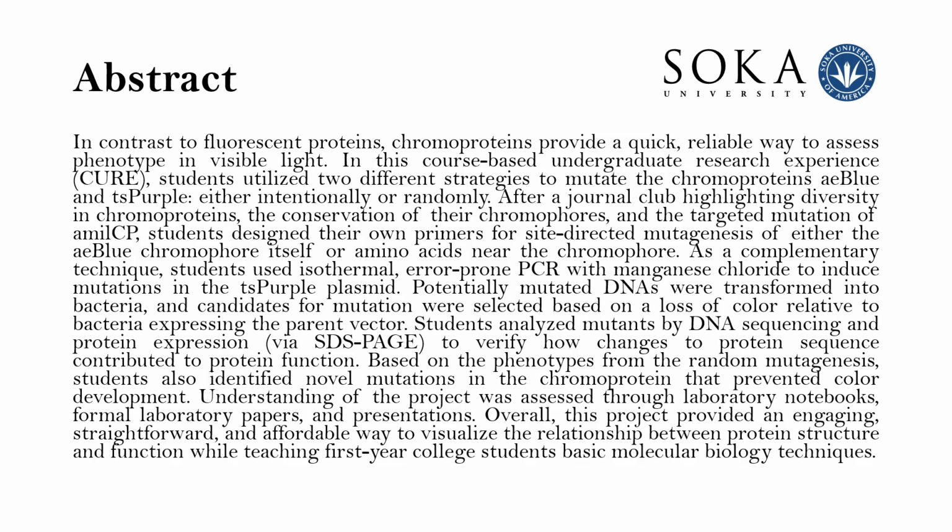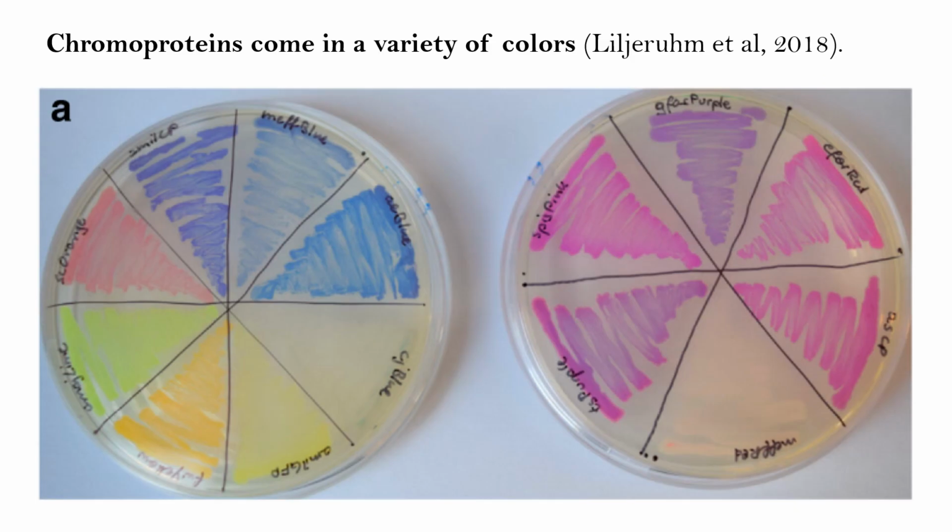Here's our abstract. So our research was based on a previous paper about chromoproteins. From this paper, we learned that chromoproteins come in a variety of colors, as you can see here. They are very easily detected in visible lights, which makes them efficient biological markers.